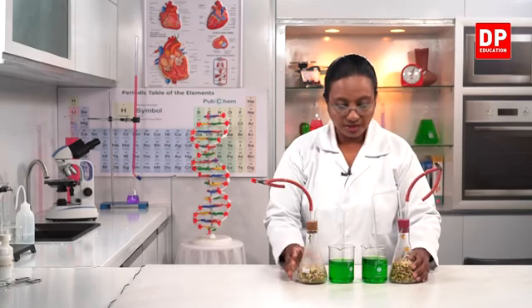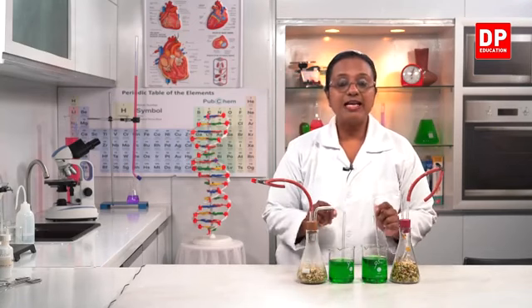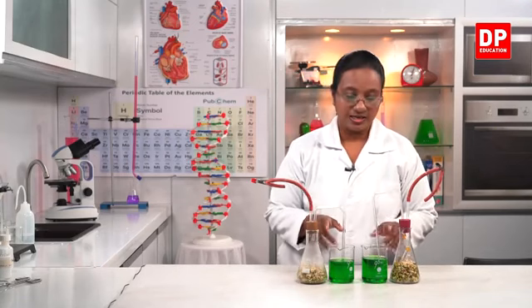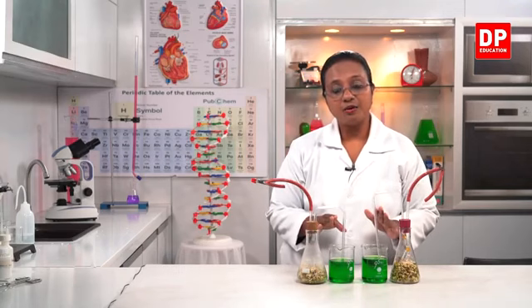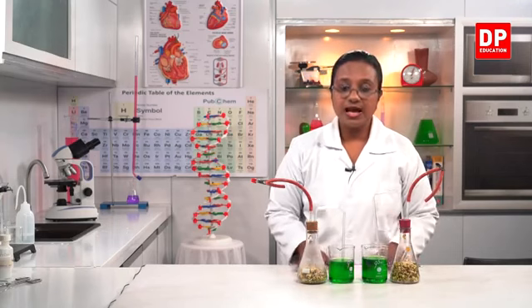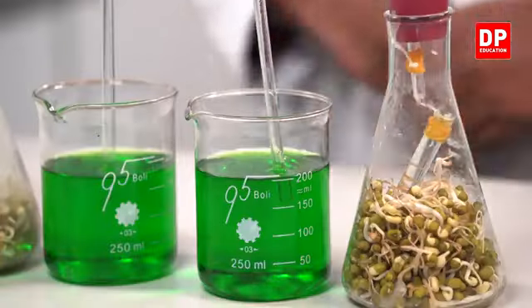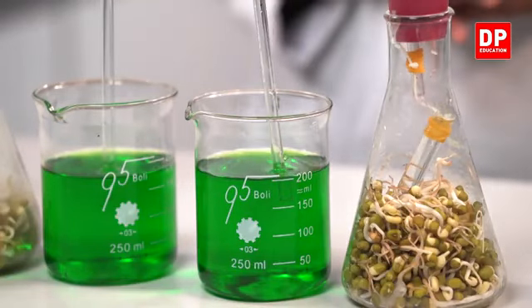So now you can see I have the colored water in both the beakers. That is to make the observation clear. When the liquid, the water, rises up in one of the tubes, you can see it very clearly. So this is the setup. Now we will observe it. So now observe both the tubes.